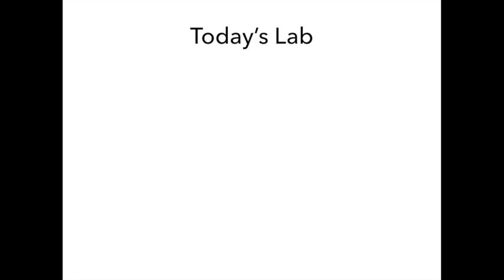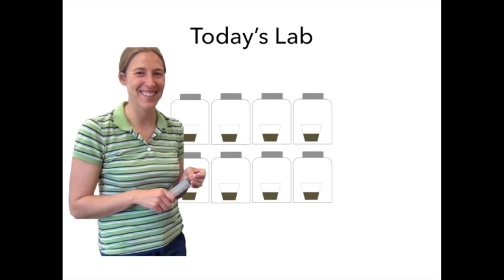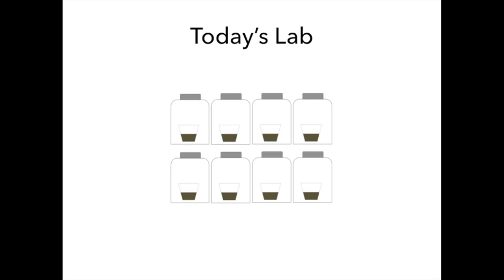In today's lab, we'll work with Michelle to perform an incubation of our own. We are going to set up a week-long soil incubation and test the effects of moisture and temperature on soil CO2 efflux rates using a factorial design with 2 moisture and 2 temperature treatments. We will have one set of samples at a low moisture content, 25% water-filled pore space, and another set at a high moisture content, 50% water-filled pore space.